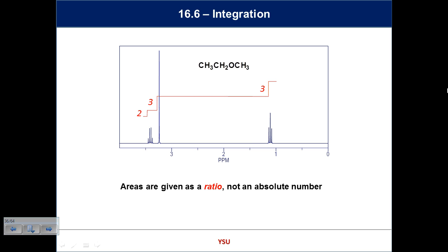So here again, we can see a spectrum that has, in that molecule, I think 3 types of proton. This methyl group is different to this one, is different to the CH2. Why are the 2 methyl groups different? What type is this on the left? Simple alkyl, right? With no O neighbor. It's too far away. What about this methyl group on the right? What type is that? O neighbor, because it's an ether, it's part of that system. And what about the CH2 right here? What type? O neighbor.